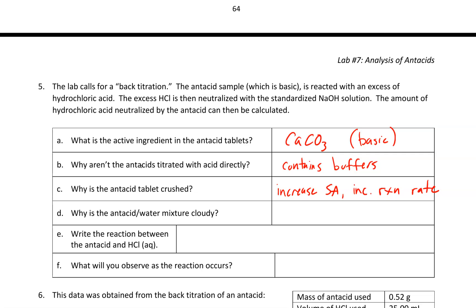Even when it is finished bubbling, there's a good chance that the antacid water, antacid acid mixture is going to be cloudy. In addition to calcium carbonate, the active ingredient in an antacid tablet, there are inactive ingredients, sometimes referred to as binders, that are basically there just to make the tablet bigger. If it was only the active ingredient, those tablets are going to be small, maybe difficult to work with, maybe fragile.